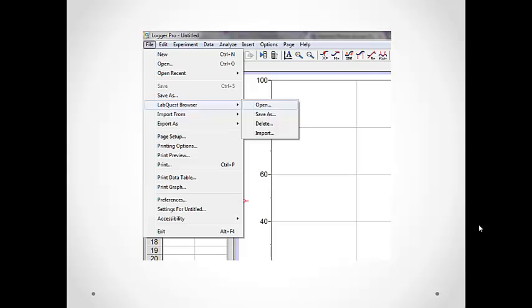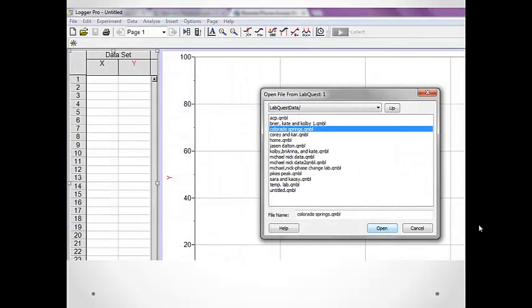In the event that you do not get a message asking if you would like to import your data, you can still find it if you have saved it onto your LabQuest. Under File, choose LabQuest Browser and Open. Find your file and choose Open.